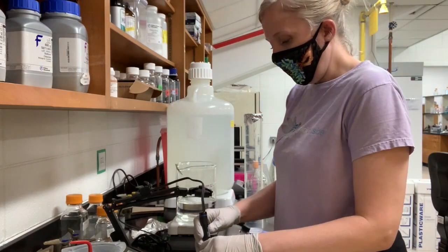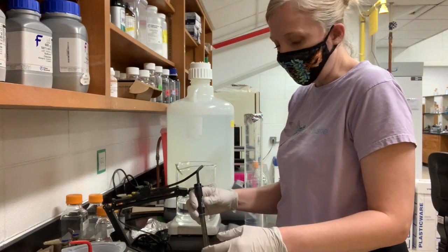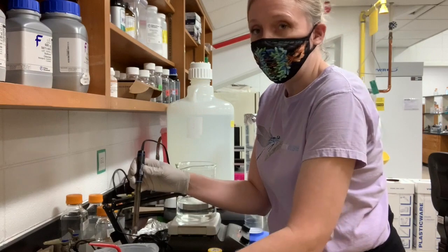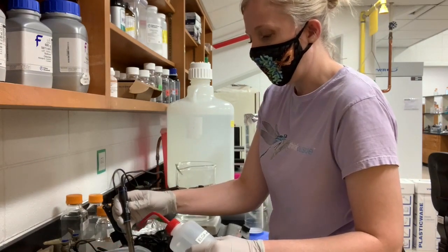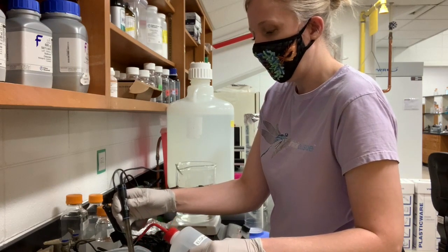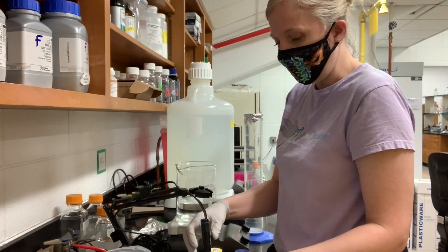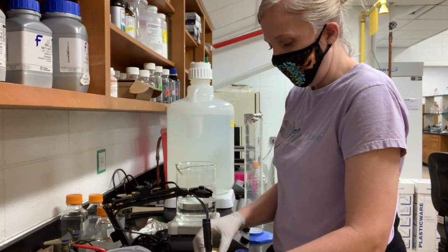Okay, so the next thing you want to do is you never want to go from one solution to another without rinsing it. I actually should have rinsed it before I dropped it in the pH 7. So there will be a bottle of DI water, and there will be a container like this at the bench. And you can rinse the pH meter with the water, being careful not to shoot water into that little hole that's in the meter. And there should be chem wipes around that you can use to remove the excess water. And from there, you'll drop the meter into the pH 10 solution. I'm just going to put the cap on the pH 7 while I'm thinking about it.